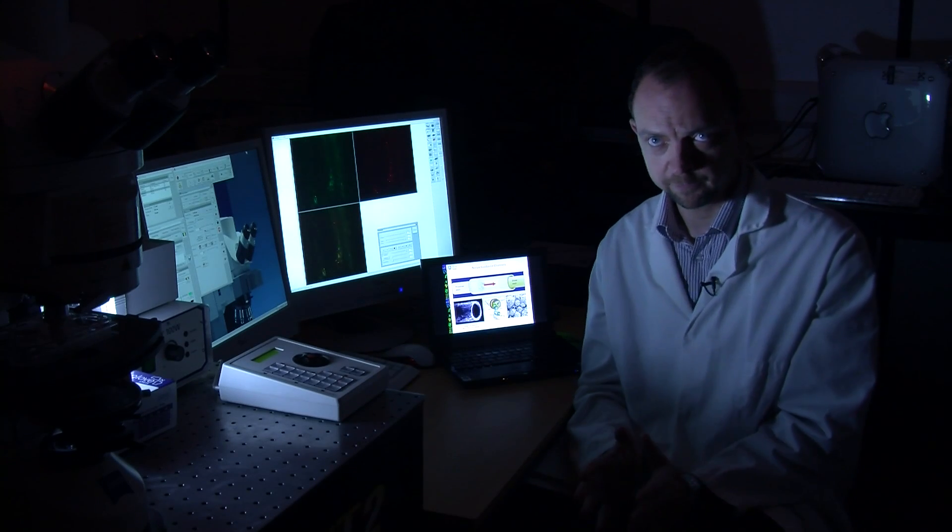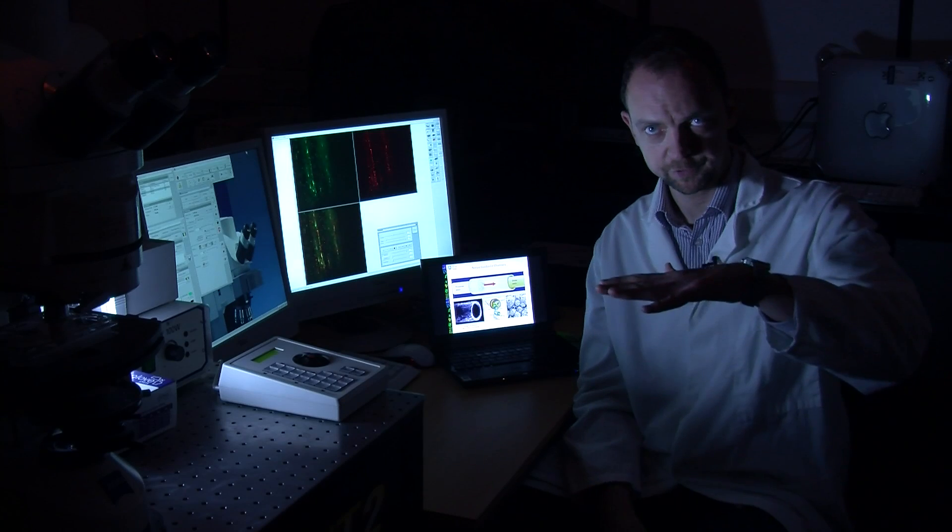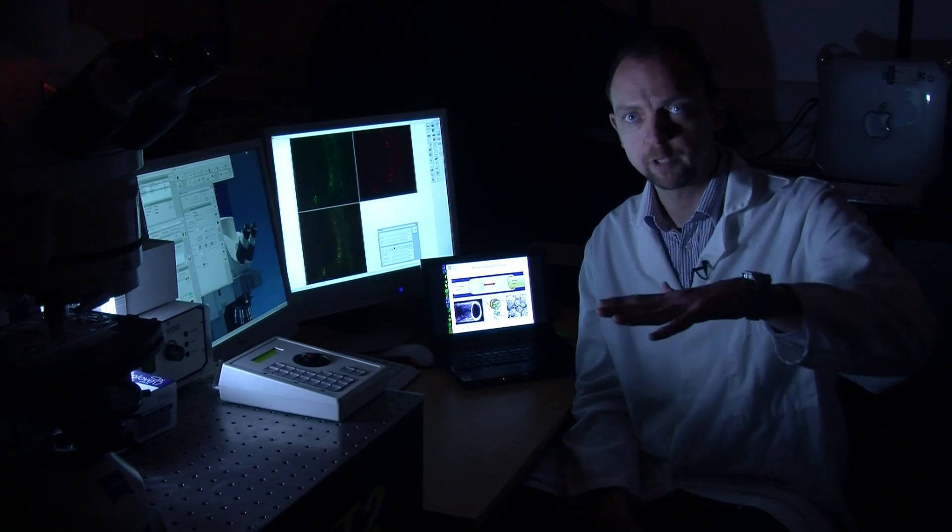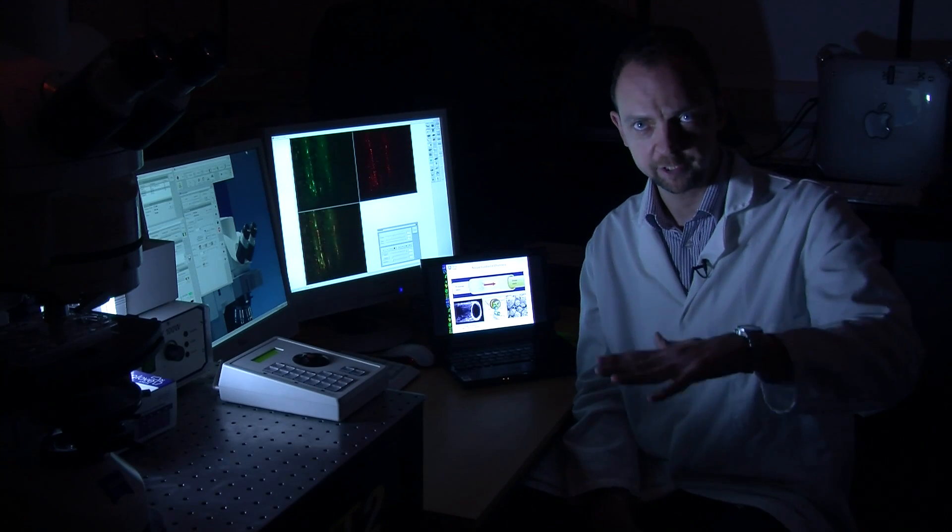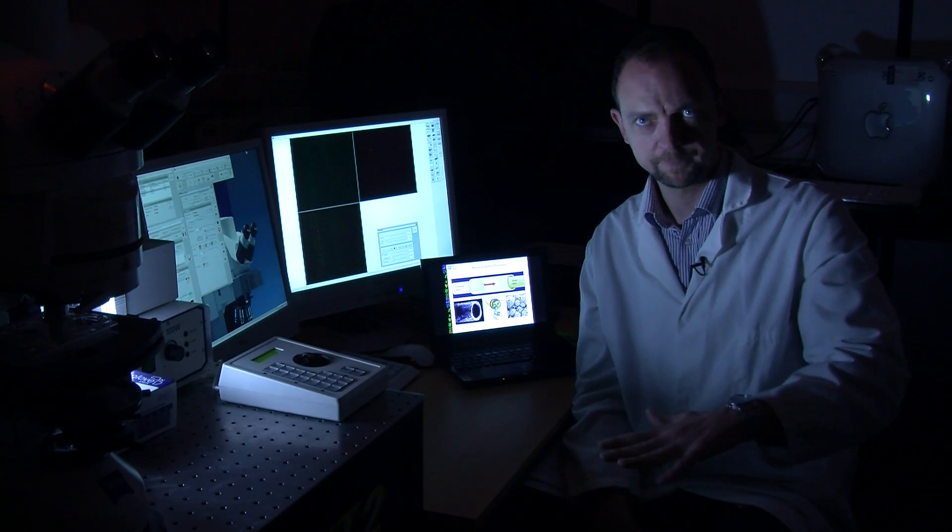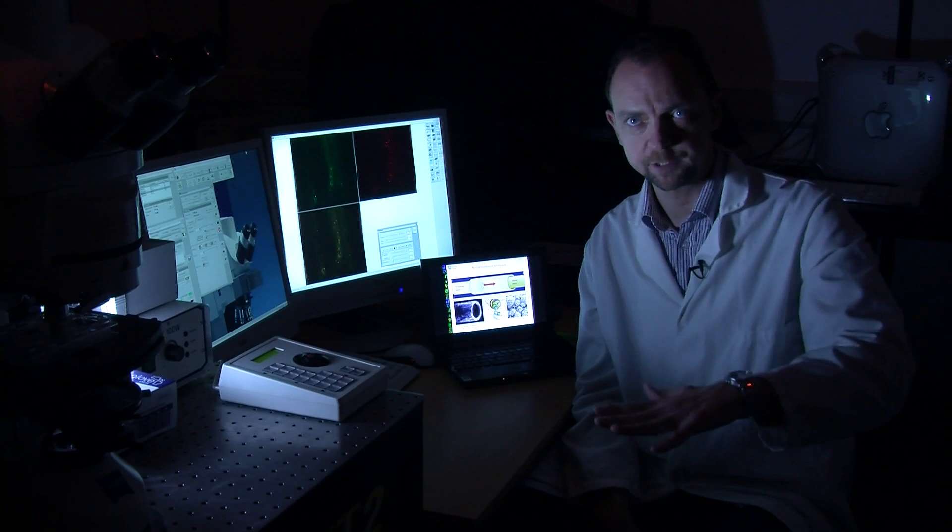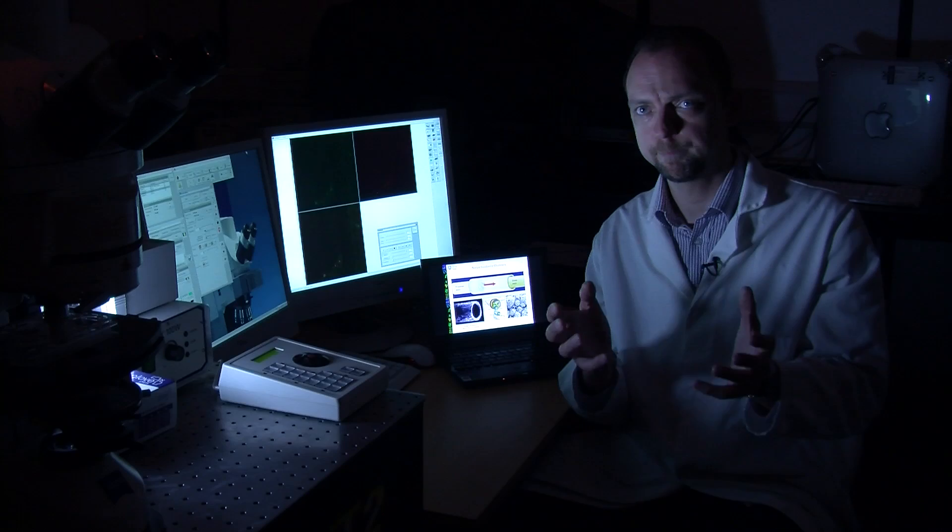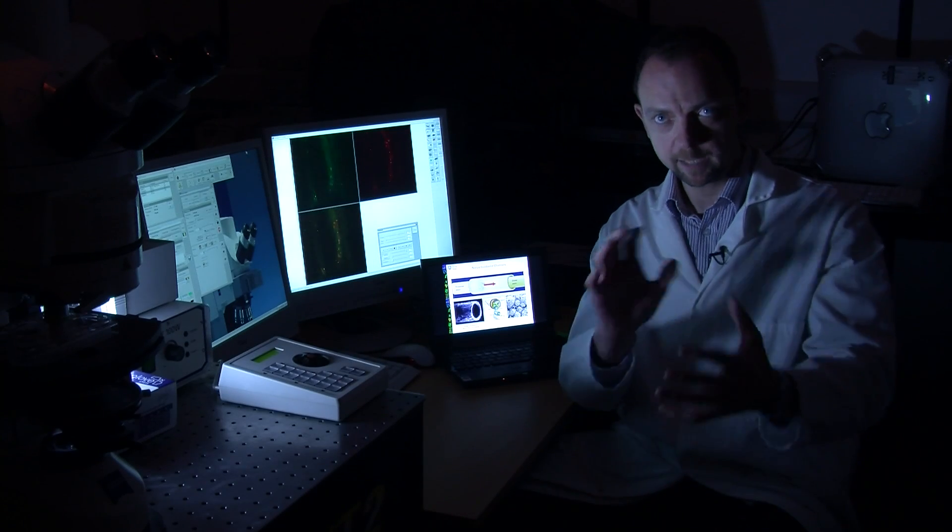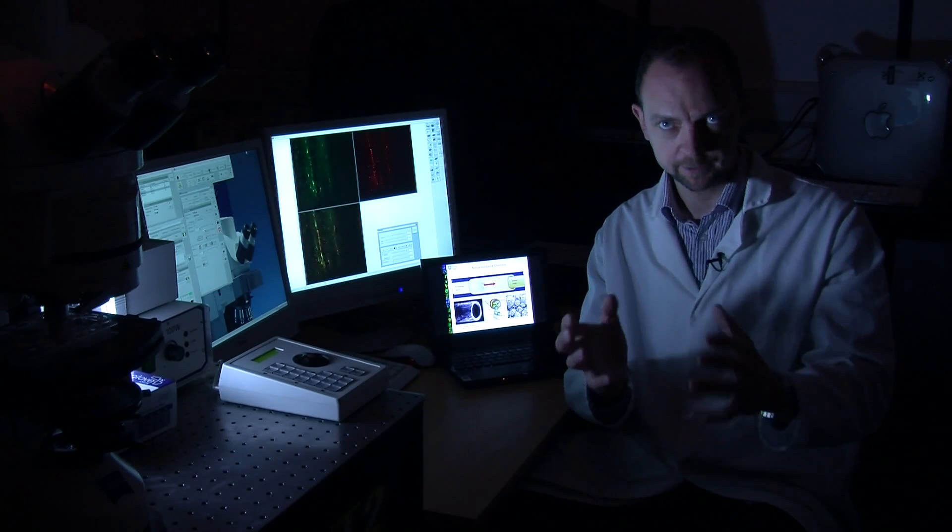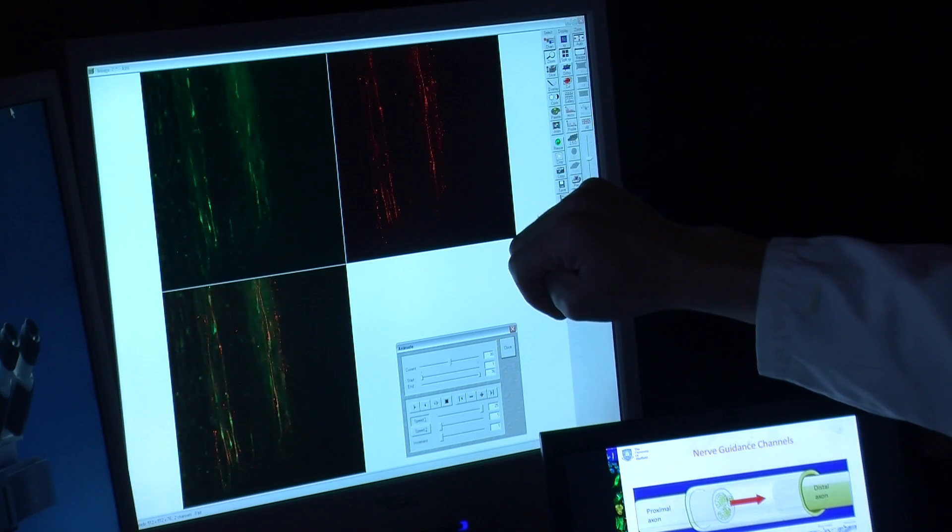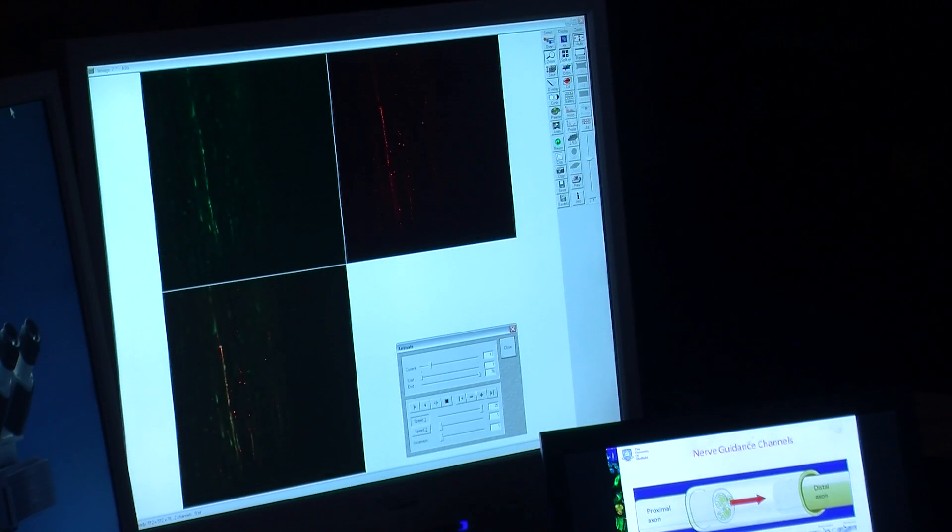We take a series of individual pictures that frame by frame image through - we call it a Z series that images from the top to the bottom of that sample. That can take quite some time, maybe half an hour. But we build up a picture that enables us to view that entire sample. The images on the screen here are actually passing through into and out of that individual sample.